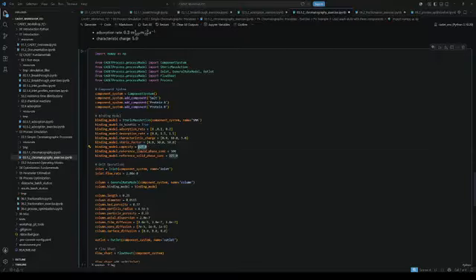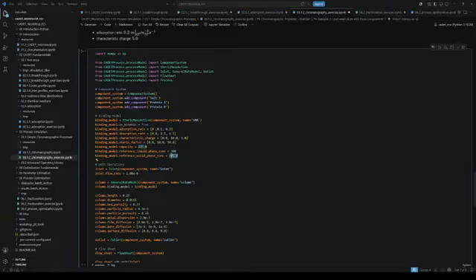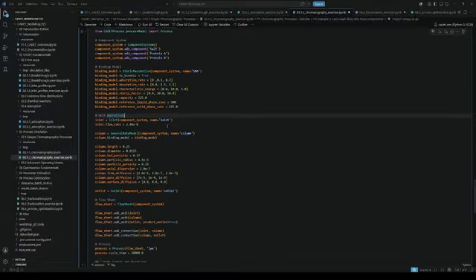We then have to define a capacity of our column. This is this Q0 mentioned in the lecture. And these are internal references because the charge is going to go into the exponent of the equation, which means that the values can get really large really quick. So we're using a reference concentration to normalize some of the values. However, this is purely a mathematical feature of the model and doesn't impact our solution.